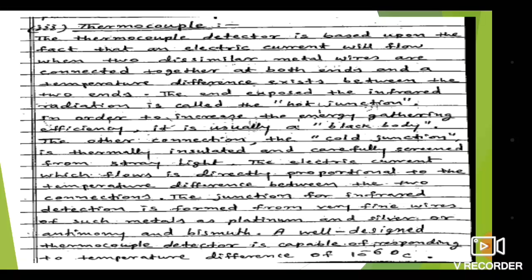It is usually a black body. What is the purpose of making it a black body? To get more energy, that is, energy gathering. So the hot junction is preferably used as a black body, while the other junction is the cold junction, which is insulated and carefully screened from stray light. Means the stray light or infrared radiation cannot fall on this end.